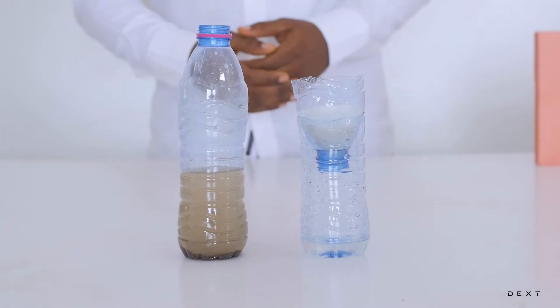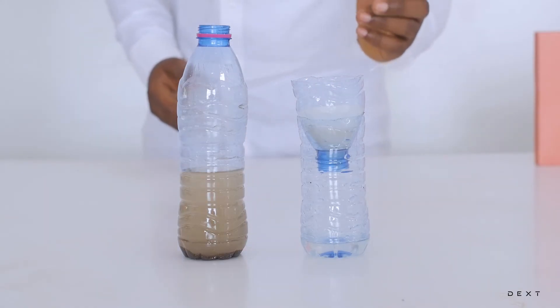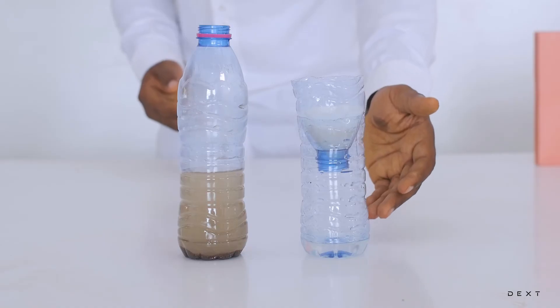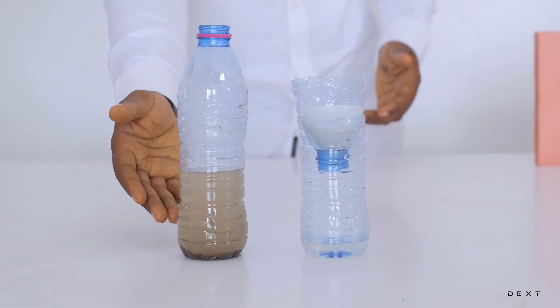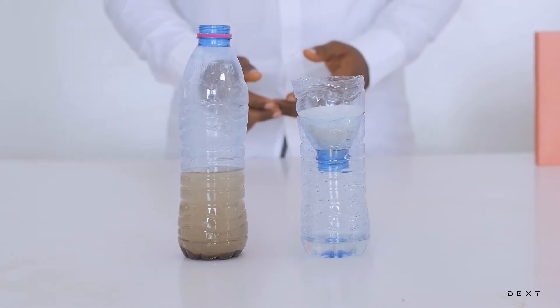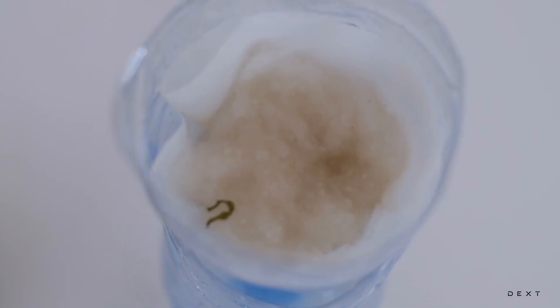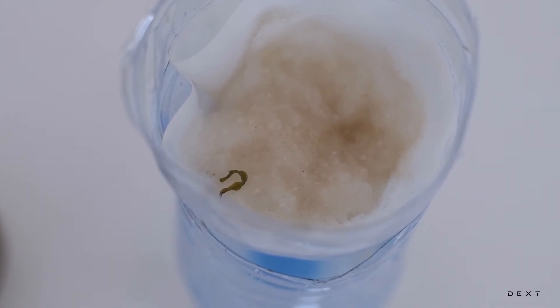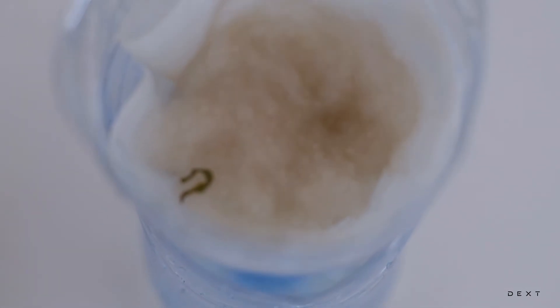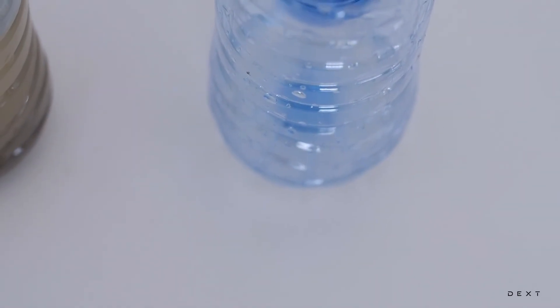So there you have it — dirty water and a simple filtration setup. The water isn't drinkable yet, but you can clearly see that the water which has gone through the filtration system is much cleaner than the filthy water we poured in. When you look on top of the filtration system you can see all the dirty particles and suspended items that have been trapped by the cotton and the filter paper, while relatively cleaner water has passed through.